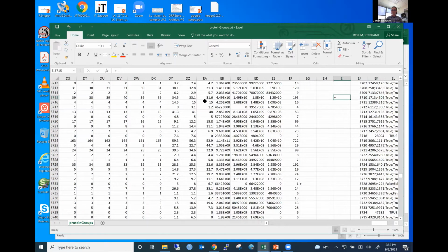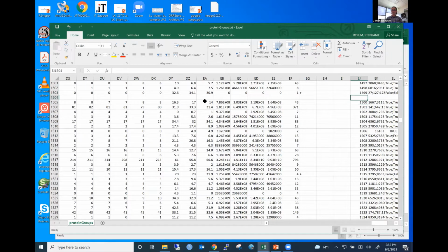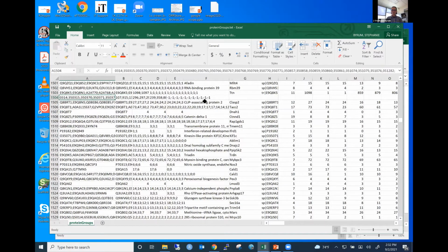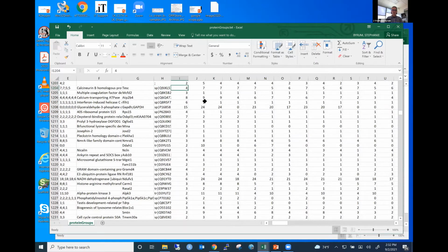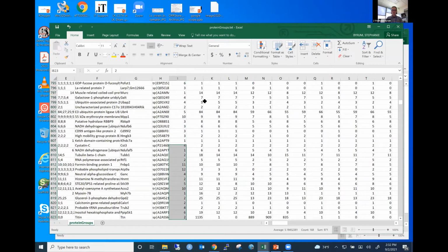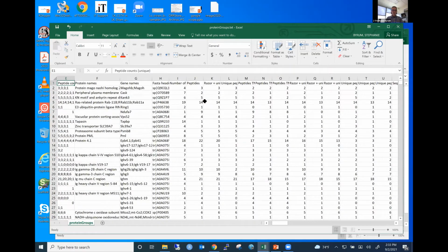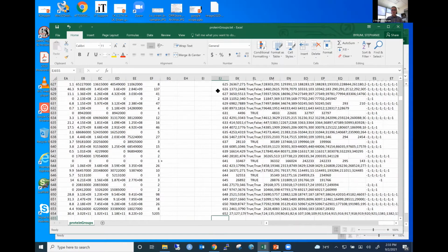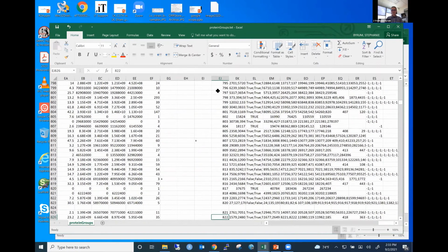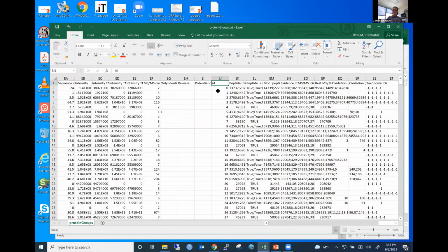I've seen some goofy things with MaxQuant output files. Sometimes they're not all consistent, like this right here. And this is like a programmer's nightmare because it's never a consistent pattern. You have to find these empty columns in here where it's just a bunch of gibberish, and they can mess up your data frame. So when we're pulling information out of this, you may only pull the first few rows and not all of the data, just due to having these extra little miscellaneous identifiers in here. I have seen that quite a bit. One way to get around that is to sort this by this ID column first, and then all of those will be at the end, and you can get rid of them. But starting with just MaxQuant output is really painful. It's a painful learning process.